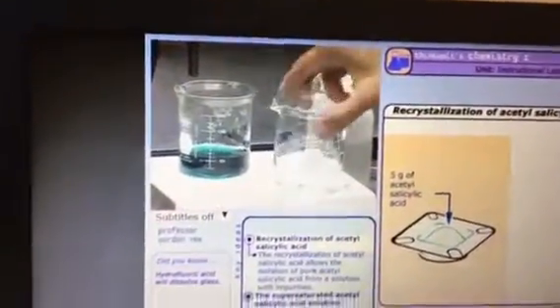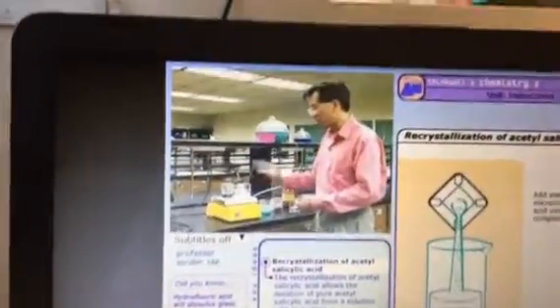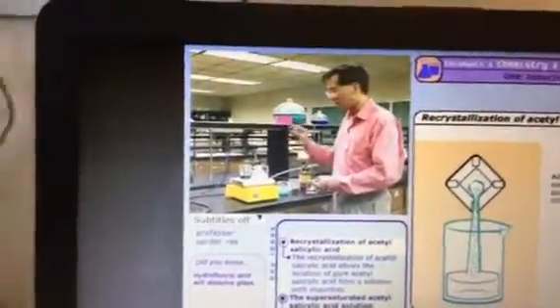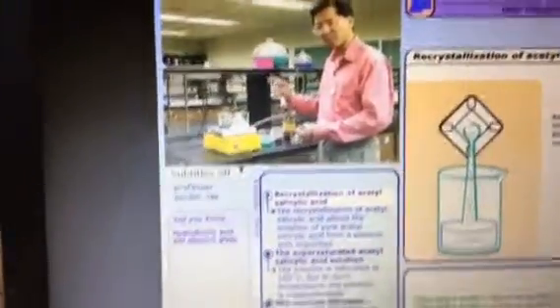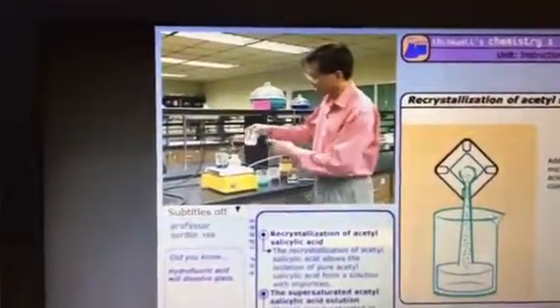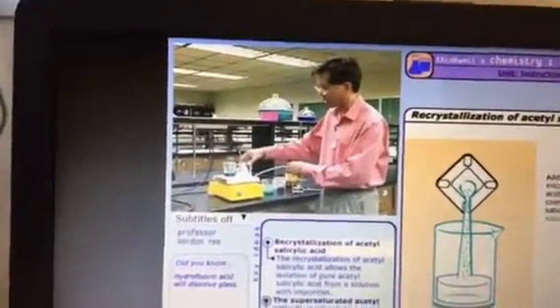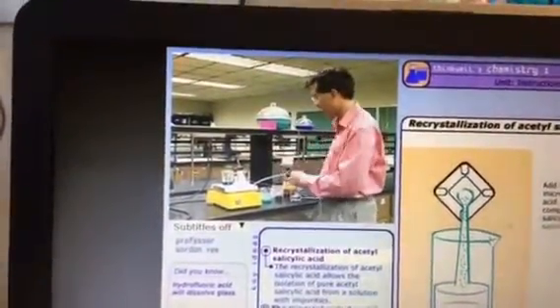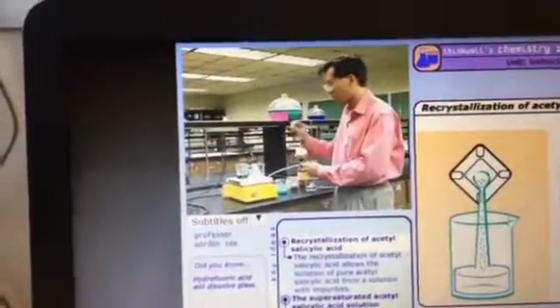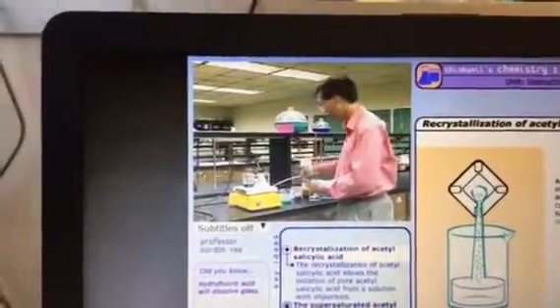at 100 degrees C. What does saturated mean? That means that the absolute maximum amount of acetylsalicylic acid has been put into the water, and there's no solid present, okay? So I could take this and warm it up on the hot plate here until the water is boiling, and just keep adding little bits of water until I get exactly to the point where I've added just enough water to dissolve everything and no more, okay?